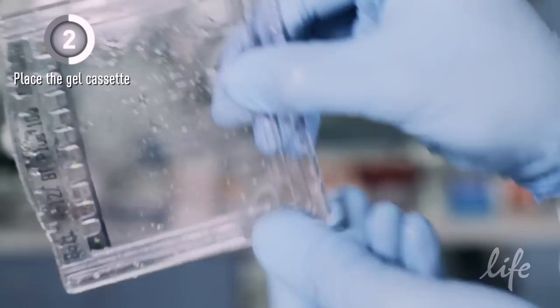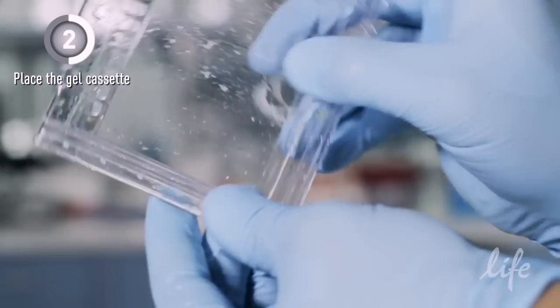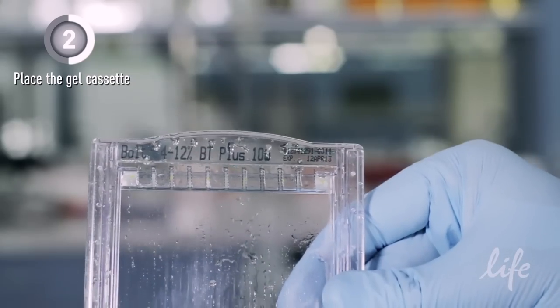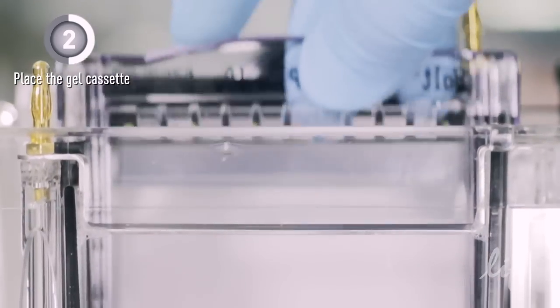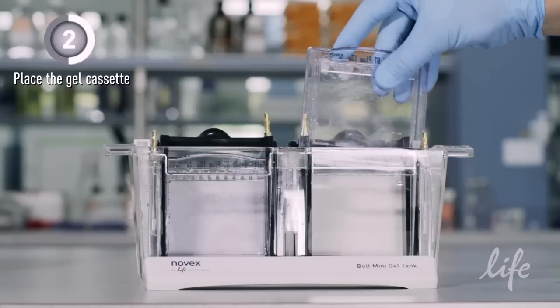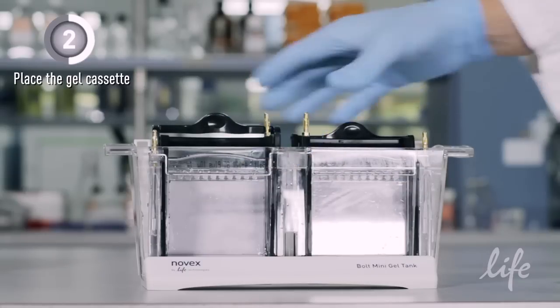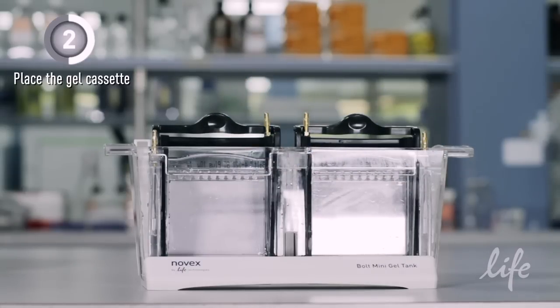Invert the gel and shake to remove the buffer. Now you can place the gel cassettes into the clamps with the lower cassette side facing you. Secure the gel by closing the clamp. The lever should come to a stop and hold the gel firmly in place.